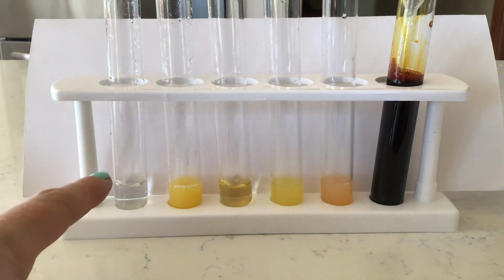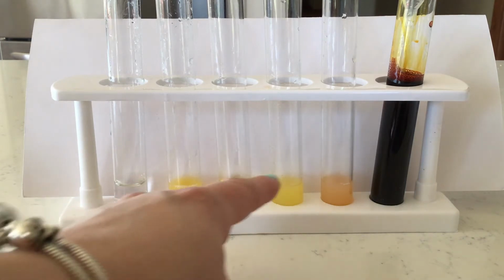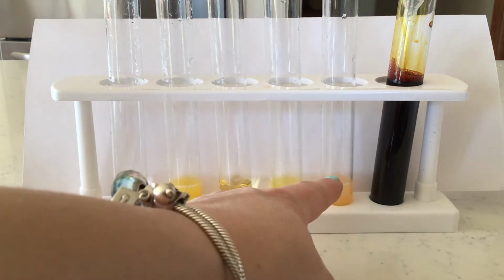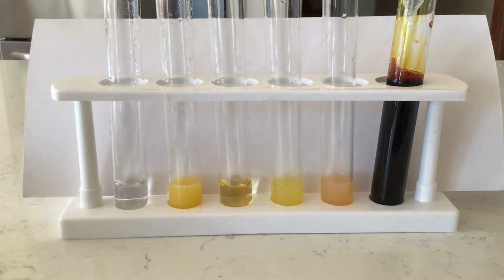You'll see I have water, orange juice, apple juice, pineapple juice, grapefruit juice, and this is my iodine. So all of these are set up, and each test tube has 5 milliliters of the solution or the juice that I am testing. You'll notice on the left we do have water. Water is our control, meaning it doesn't have vitamin C, so we can see what iodine would do in just a solution that doesn't have that. So that's going to be what we would compare the other ones to.